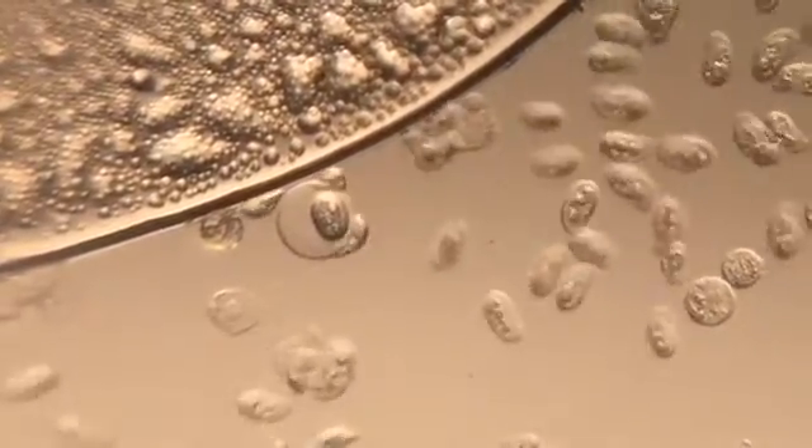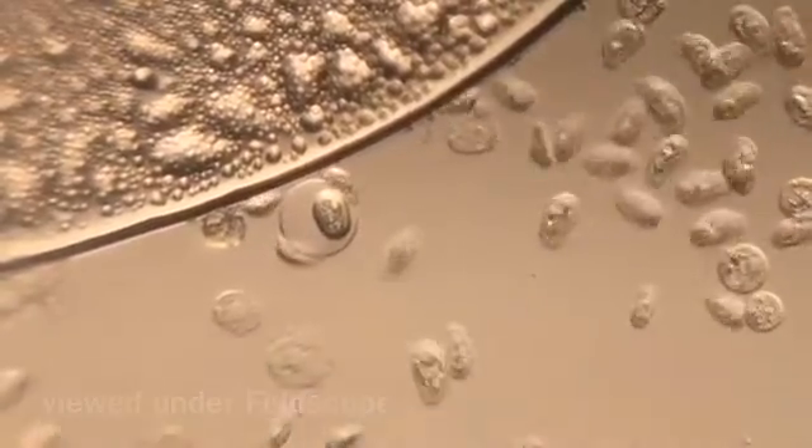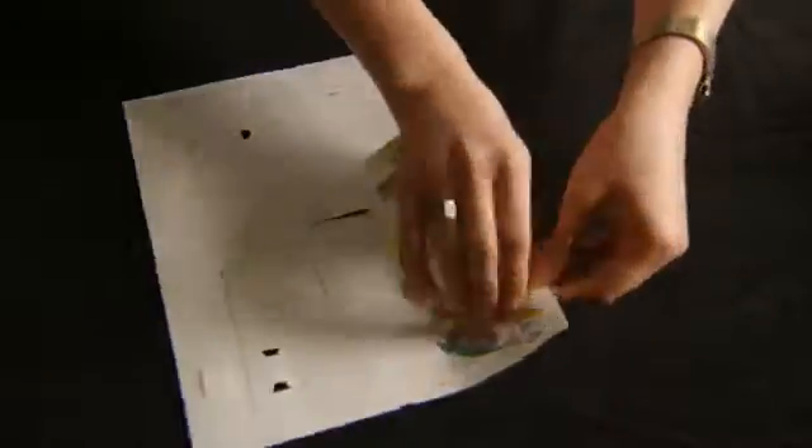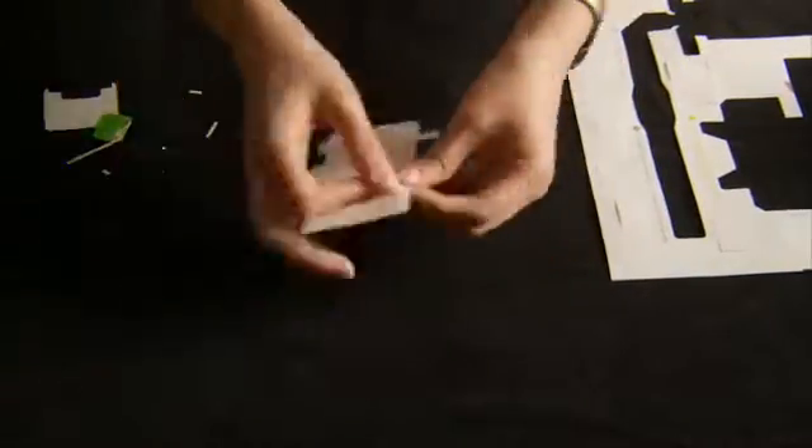This is the reason why we should keep making these microscopes. My name is Manu Prakash and I'm a faculty at Stanford. I'm also the co-inventor of Foldscope. I'm Jim Cybulski, I was a PhD student in Manu's lab at Stanford University and I'm also a co-inventor of Foldscope. Foldscope is an origami microscope that you put together yourself by folding a sheet of paper.